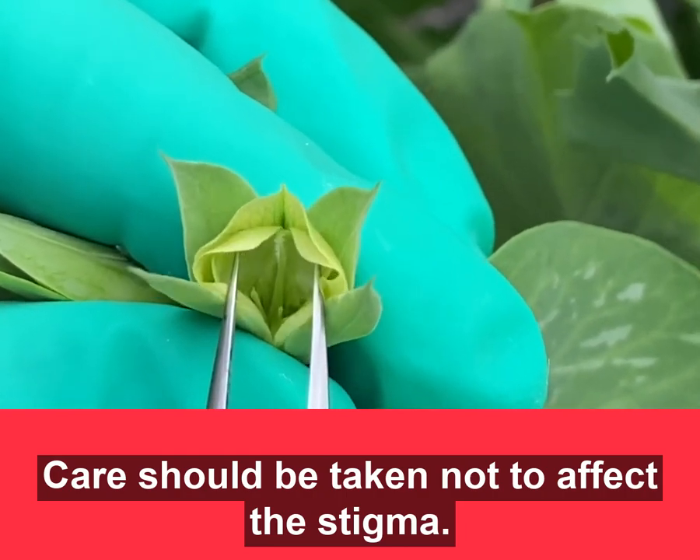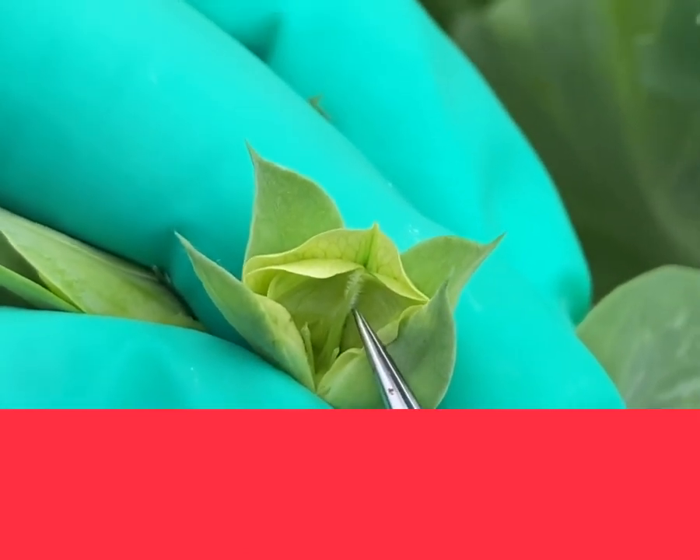All the anthers are removed from the bud, and you can see that the pistil part is safe.